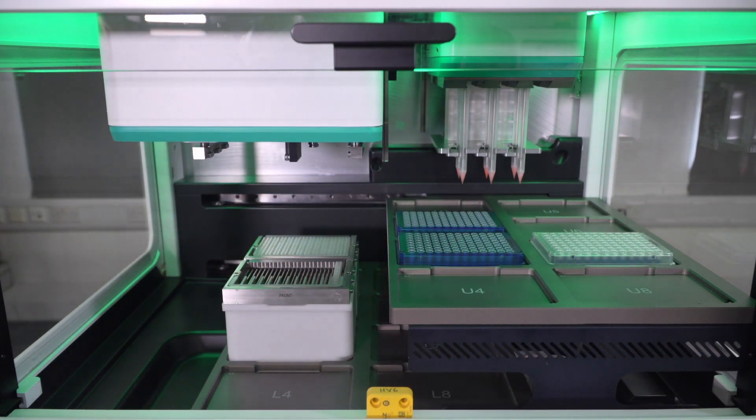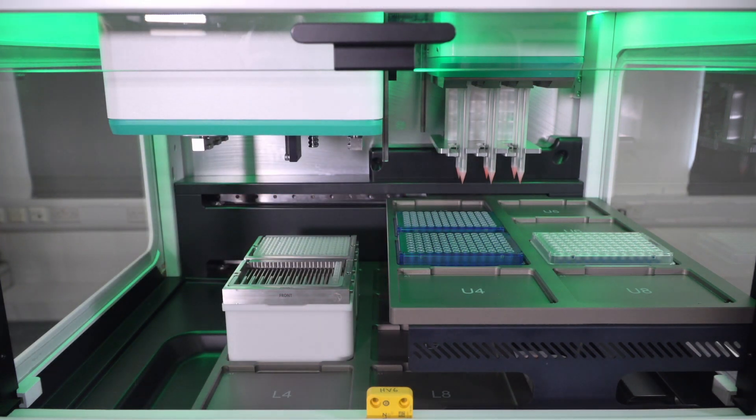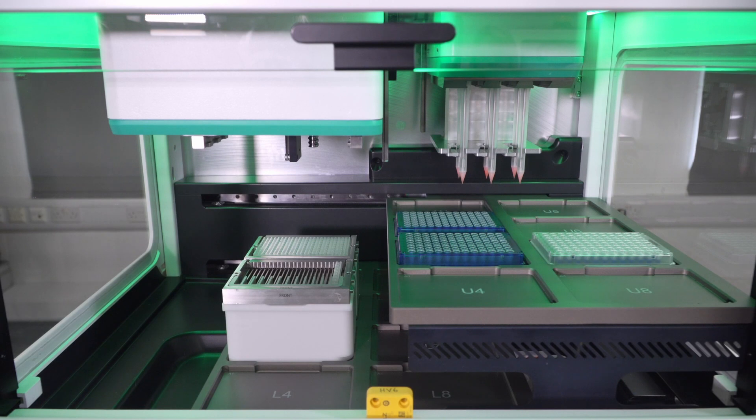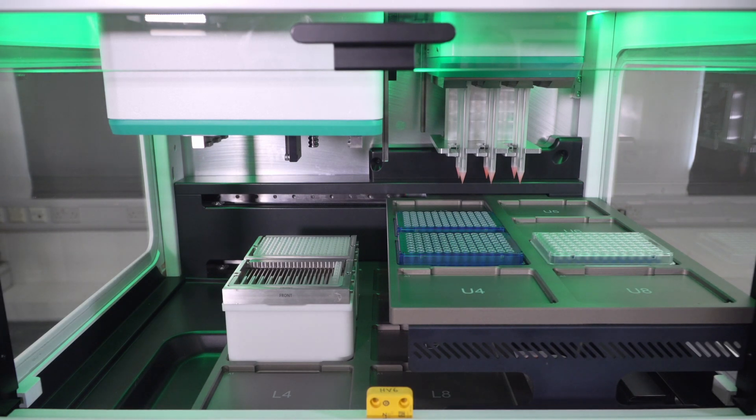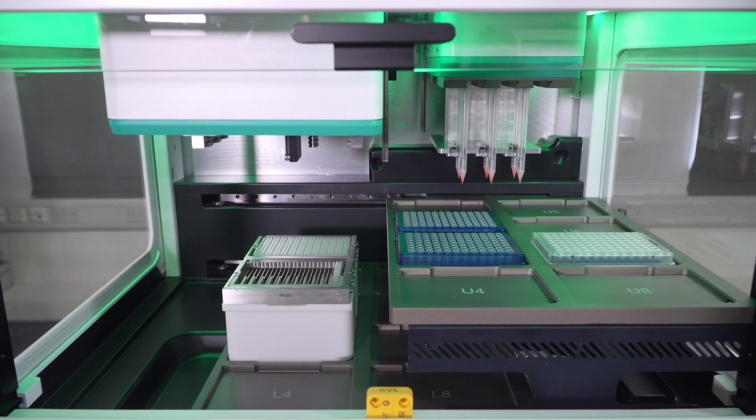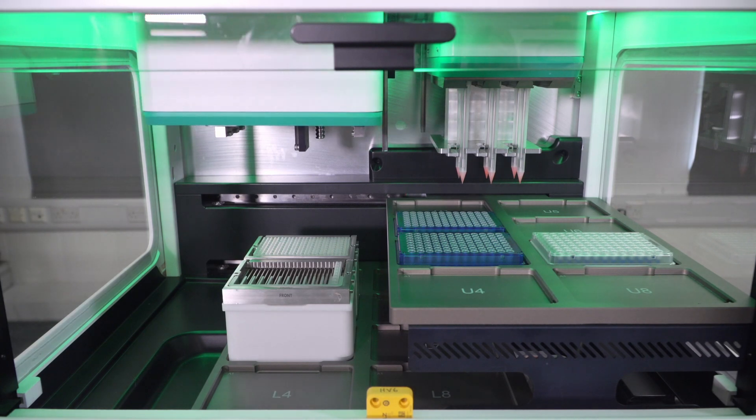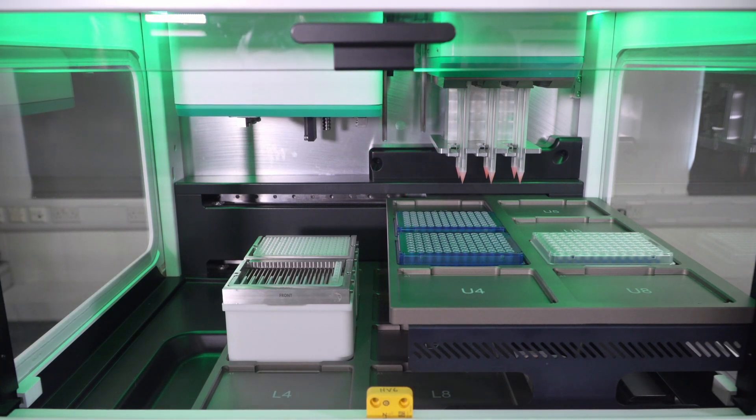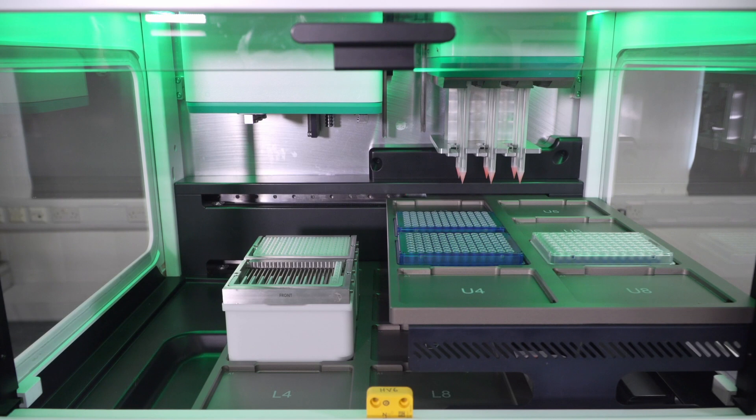Now the tips are unloaded. And this is the end of our protocol. At the end of the protocol, the instrument will hold. You'll see that the pipetting head is going to the back. And this is the end.